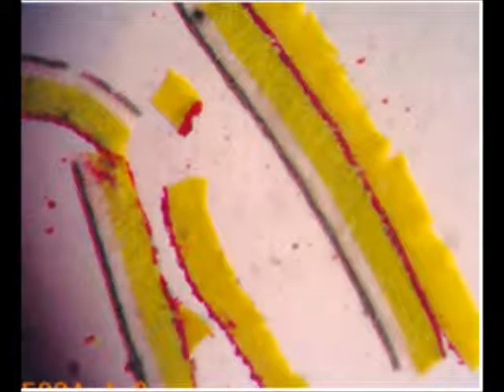Each layer of the paint sample can be absorbed differently. Binders and resins will have different absorption bands than pigments and extenders. This also helps in identification of paint layers. Each layer of paint, primer, or binder will absorb differently and can be identified. Using this information when compared to a possible source of the sample, a comparison can easily be made and a linkage can be formed. The shape and thickness of samples are important when using the FTIR microspectrometer.